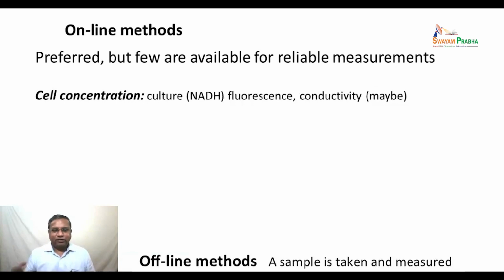Whereas in a bioreactor, typically what is done is a fiber optic probe is interfaced with the spectrofluorimeter. The fiber optic bundle, some bundles carry the excitation wavelength from the spectrofluorimeter and project it in an open-ended geometry into the bioreactor.